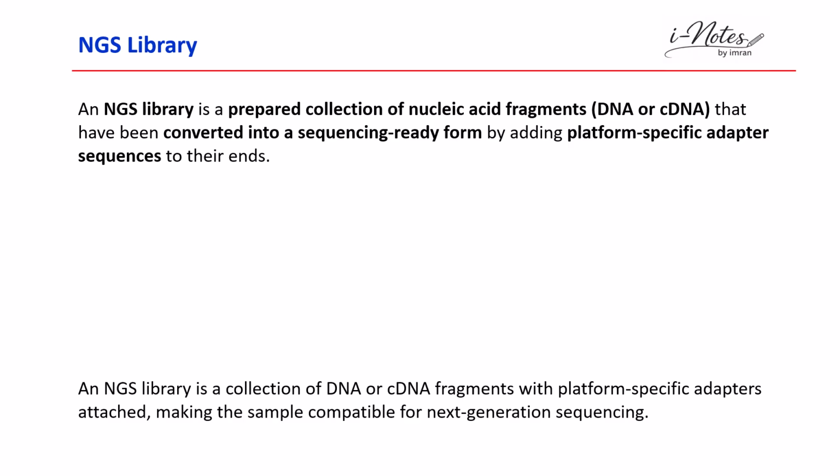So an NGS library is a prepared collection of nucleic acid fragments, whether DNA or cDNA, that has been converted into sequencing-ready form by adding platform-specific adapters.